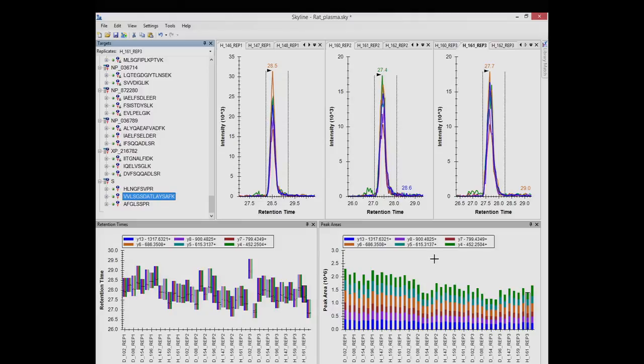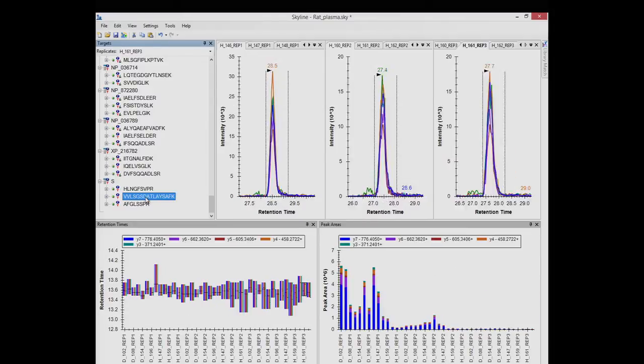I took technical replicates, right? My hypothesis here is that there is some signal decline over time in this experiment for all my peptides. Then it's going to be sort of similar to this, but not really a 200x difference.